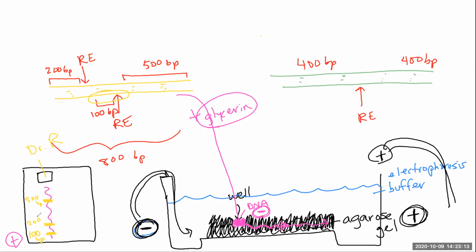All right, so when I do my DNA fingerprint on the specific region, I'm going to get a pattern after I've amplified my genes and after I've cut them with these restriction enzymes that looks a very specific way. I'm going to have 3 bands, and that is specific for me. Okay, let's look at Dr. Bud. Dr. Bud, let's put his DNA in this little well.